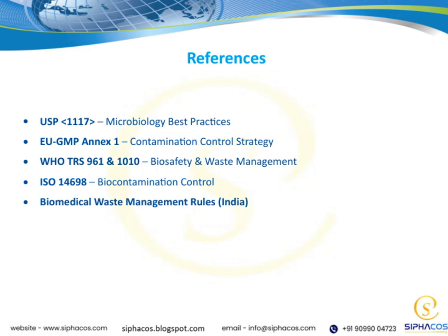Moving on, WHO TRS 961 and 1010 focus on biosafety and waste management, emphasizing safe handling and disposal of biomedical waste to protect both personnel and the environment. ISO 14698 is another important standard that provides guidance on biocontamination control, helping us maintain a clean and controlled environment.